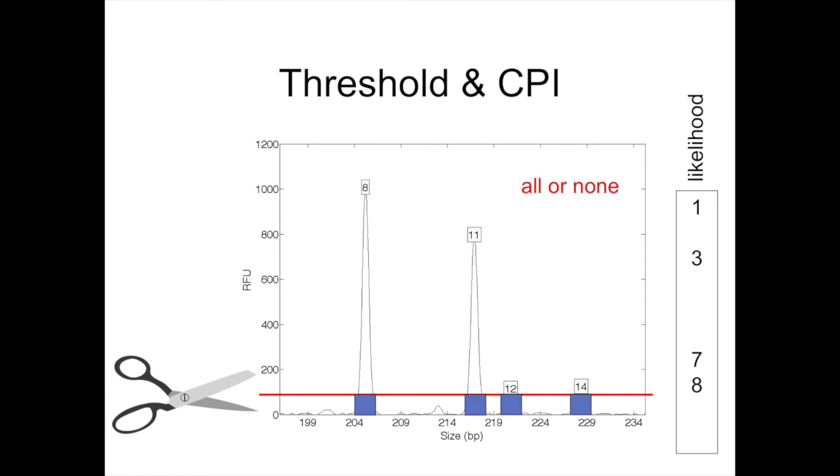So over the years, there's been some pretty bad methods of interpreting DNA mixtures. The concept initially with thresholds was that if thresholds worked very, very well with single source DNA, why wouldn't they work very well with mixtures? And the reason is that you don't have one or two peaks of the same height. It's much more complex. You can have taller peaks, shorter peaks, and across the different possibilities of different sizes that are indicated by the boxes on top, there are different intensities, which are the relative fluorescence units, indicating more DNA for an 8 and 11 peak, or less DNA for a 12 and 14.